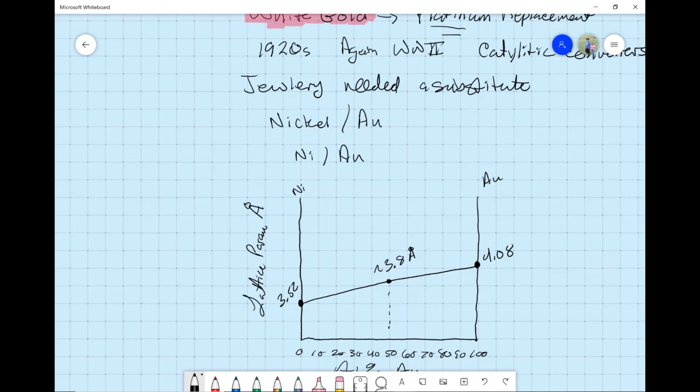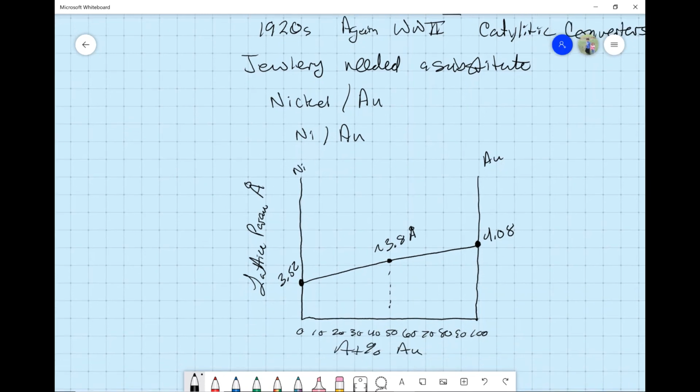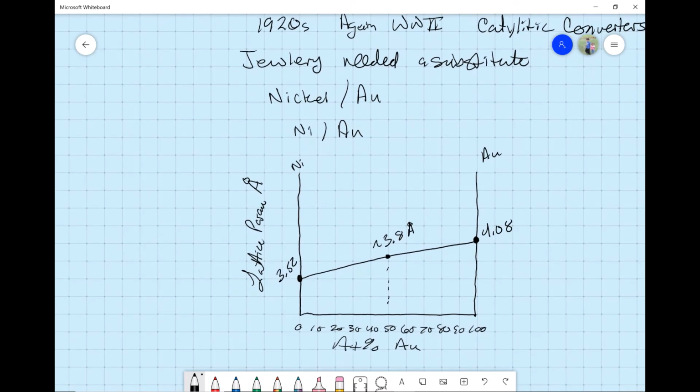And kind of an application of this type of analysis would be for mechanical alloying, where you don't melt the materials together, you put them in a high velocity ball mill, and grind them together. And then you can tell how effective you were at your alloying process this way. Anyway, again, as always, hope this was informative.